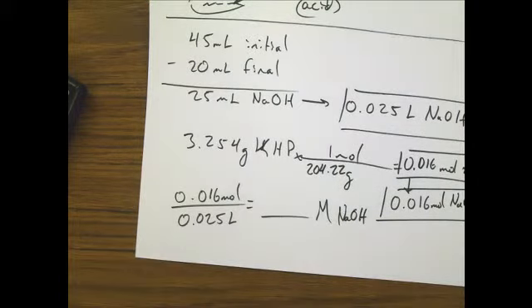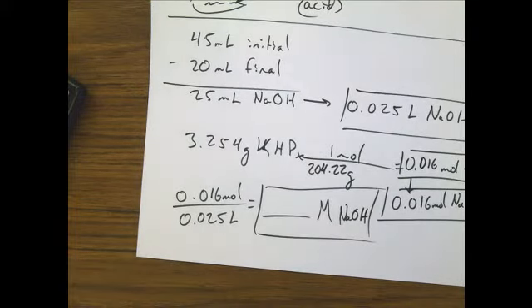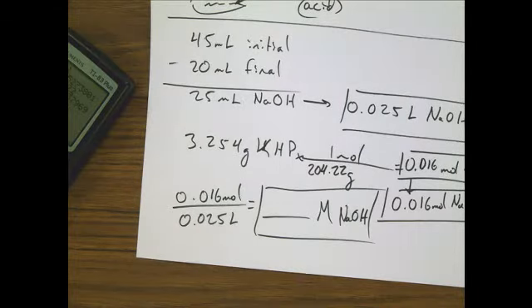Now here's the good news. You're not going to have to standardize your sodium hydroxide when you come in to do the next lab. The next lab you're going to do is actually already going to be standardized for you. So you will know this information of what you're titrating. You know how much sodium hydroxide you actually have.